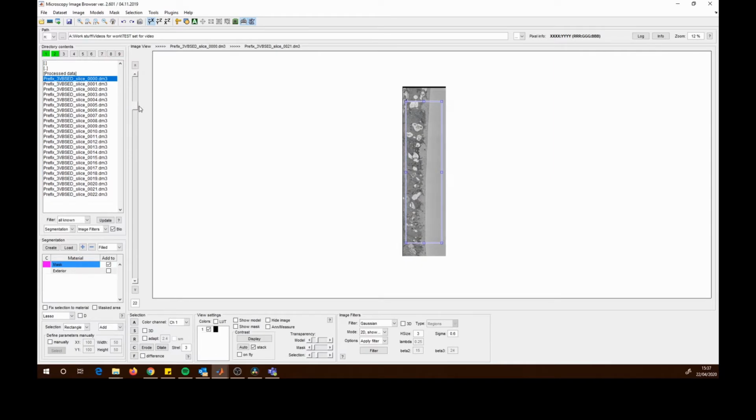So what you can do is just exclude areas you're not interested in, say if you've got one particular cell you want to segment at a time. This can make it a bit easier to handle the data rather than loading up an entire dataset. And then to crop that, you just double click inside of the box you drew.